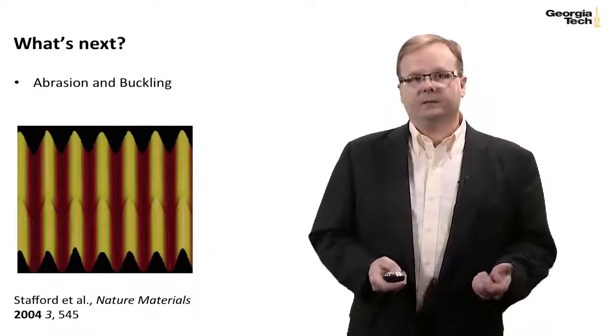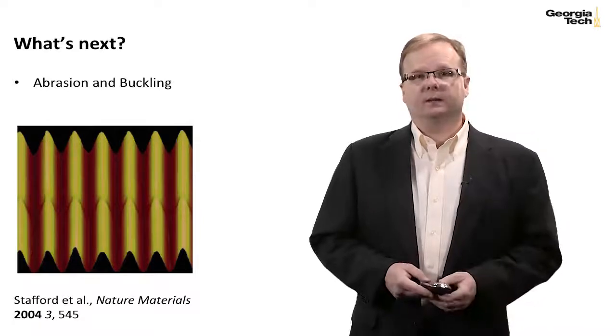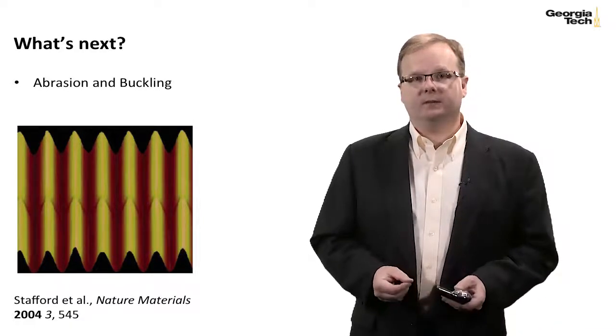So that finishes my look at indentation testing. Next, we're going to look at abrasion and buckling type tests.